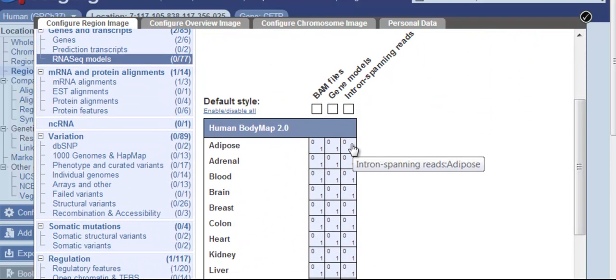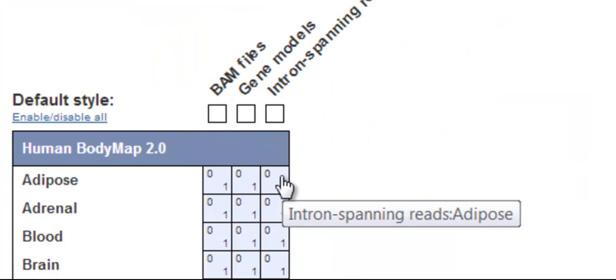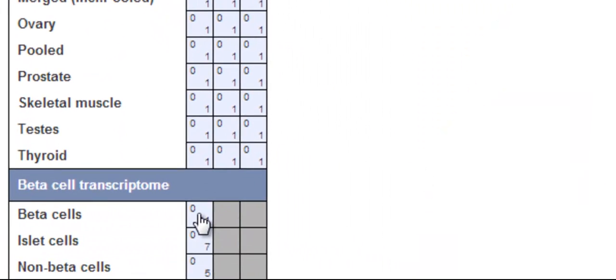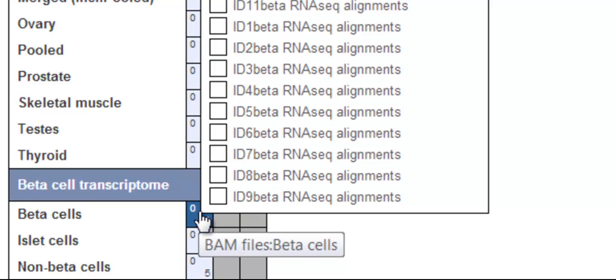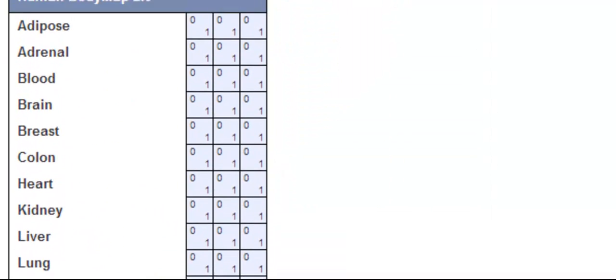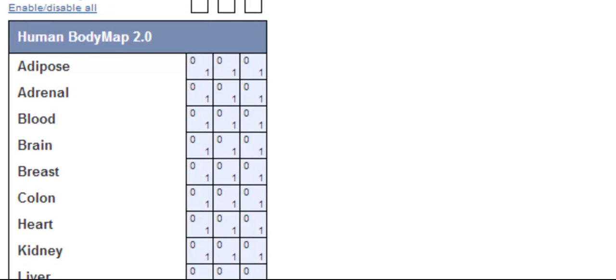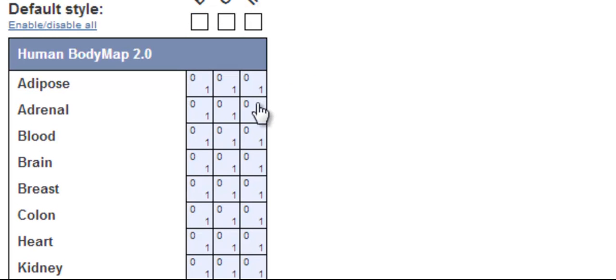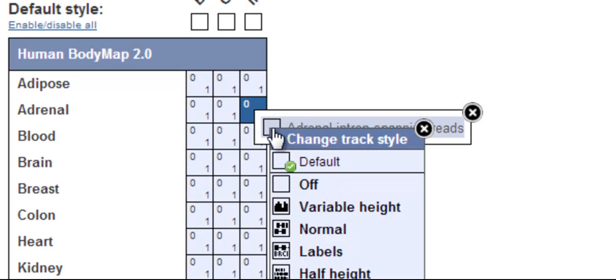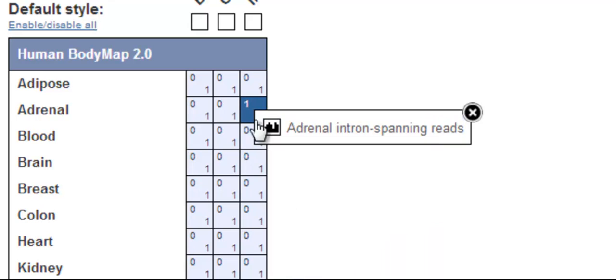On the x-axis, I have BAM files, gene models, and intron spanning reads as choices. The number indicates how many data sets there are for each tissue type. For example, zero out of one data sets for adipose tissue is turned on. For beta cells, eleven possible data sets can be turned on.